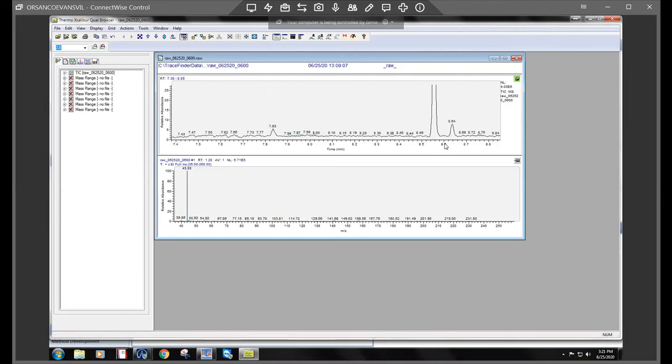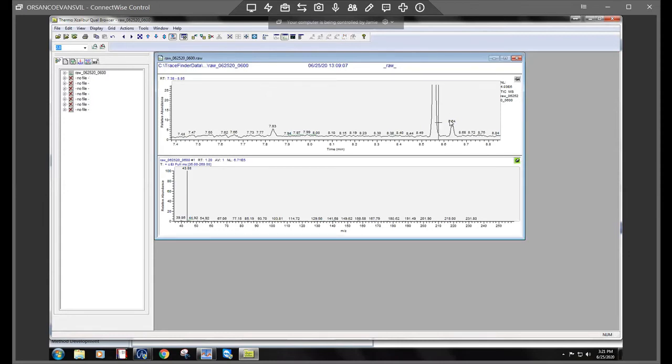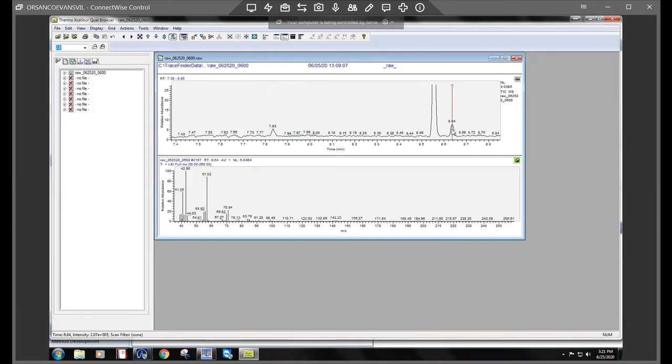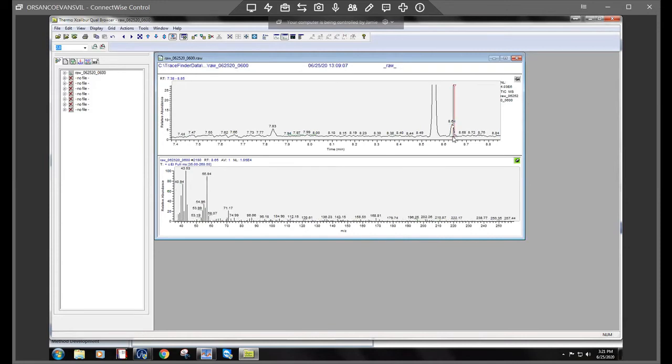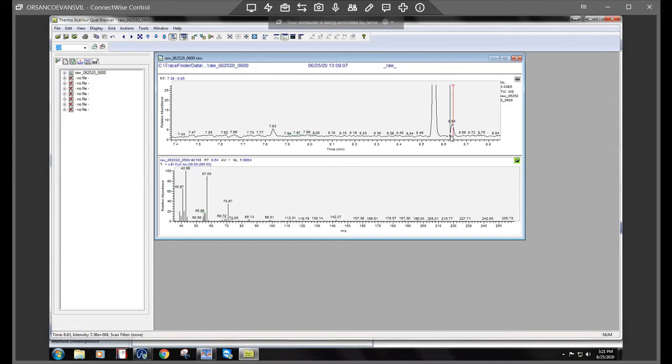We'll do both of these peaks. So I'm going to pin the spectra now and I will just click. I like to line it up to the top of the peak, to the apex.